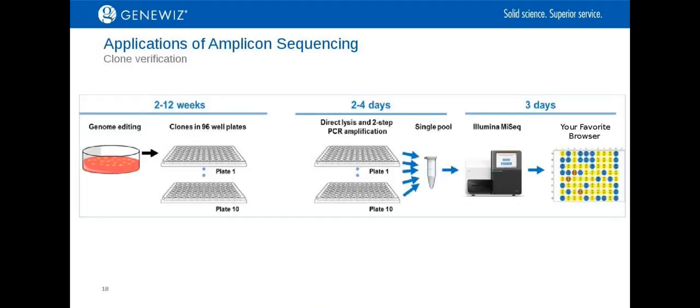So one alternative to this TA cloning and Sanger sequencing of heterogeneous clones would be using NGS. Instead of ligating the PCR product that you would get after you amplify to a vector, you can jump directly to the NGS sequencing. The other advantage of NGS is that many samples can be sequenced together in the same reaction. This makes the process scalable and cost-effective. Moreover, the analysis of NGS data is becoming easier and more commonplace to do in your lab.